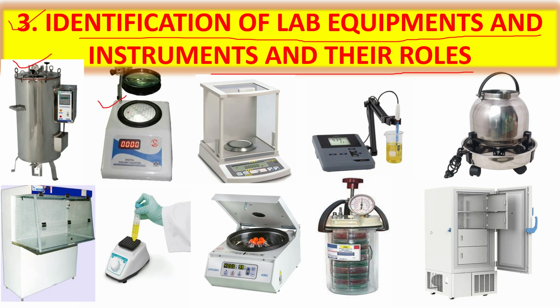So colony counter is used to count the colonies. So here we have to put our Petri plate, and the colonies are counted by a pen. Okay, and all the count you can see here digitally. And here a magnifying glass is there, to see those colonies elaborately. Okay, so next thing is the weighing balance. So weighing balance is used for weighing particular reagents or medias.